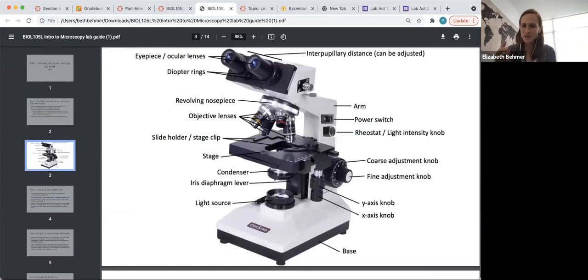When you're carrying the microscope, you should put one hand underneath the base and hold it by the arm because they're very heavy. As you're looking into the microscope, you'll see this black stage down here. This stage is where you'll place the glass microscope slide, into these slide holders or slide clips. These little rectangular specimen slides are what we dye our specimens or subjects on. Then we take those glass slides and place them onto this stage.